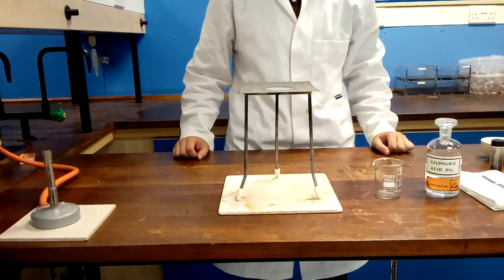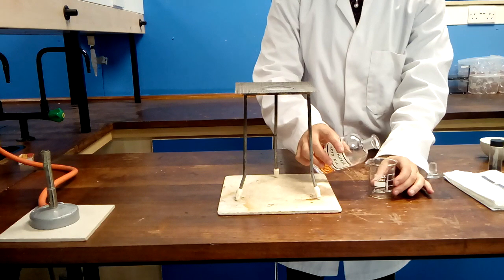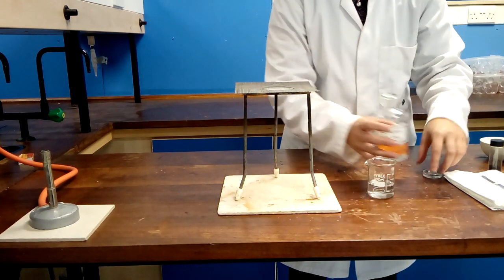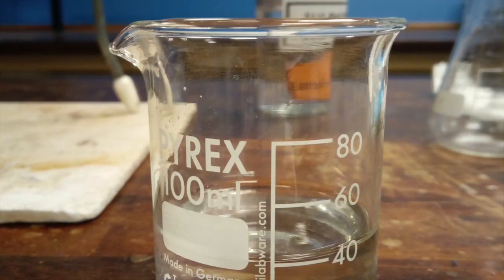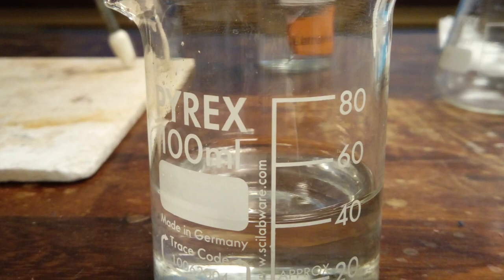First you'll have to measure out 40 cm cubed of sulphuric acid. It is not necessary to be too accurate here so you can just use the graduations on the beaker. Make sure that the surface of the liquid lines up with the 40 cm cubed mark.